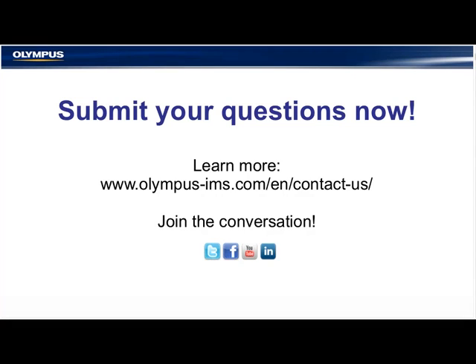There are averaging features with the instrument where you can take 5, 10, 15 tests, and if you're taking 15 tests, you want the 16th test to be the average of the bin. That's always a possibility. Those are features that are built into the UI of the instrument, of the Delta itself. So it's a very efficient way of averaging pieces that are in a large bin.